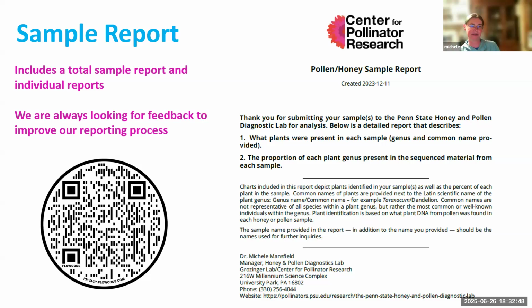But in the end, what you'll end up getting is this fancy report that I will send you. And you can also see copies of this on the website if you go to the FAQ for the pollen identification. All the reports include a total sample report. You would only get this if you submitted more than one sample. So if you submitted two, you'd get a total sample report, and then you would get your individual sample reports. And if any of you, when you get the samples, have ideas or feedback to make it more user-friendly, I'm all ears.